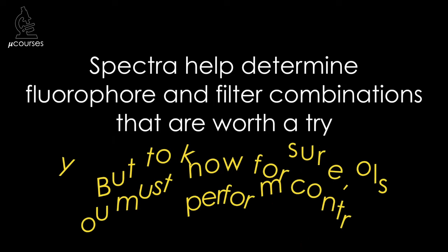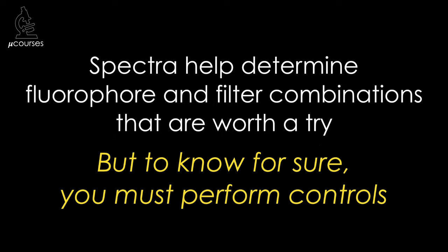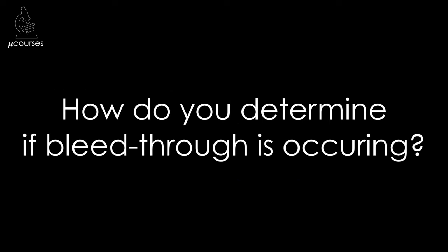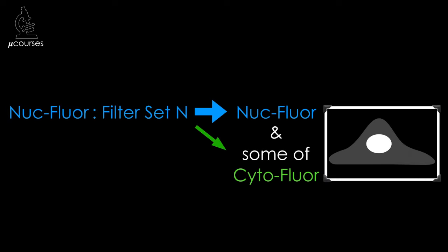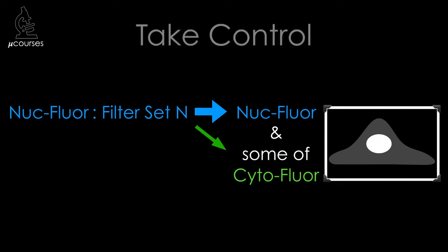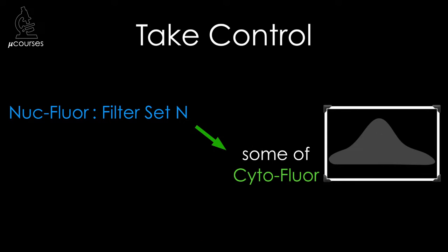But the only way to be sure bleed-through is not present in your images is to control for it. Controlling for bleed-through is absolutely required for all co-localization experiments. When we image nukeflor with filter set N, we detect both nukeflor and bleed-through from cytoflor. The control specimen that would reveal bleed-through is one that does not contain nukeflor — any signal seen in that sample with filter set N is coming from something other than nukeflor. We call these single-labeled controls.